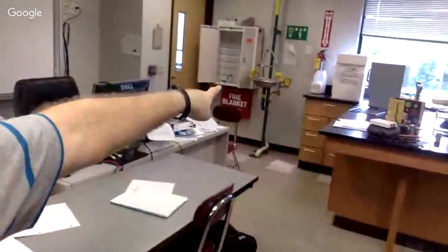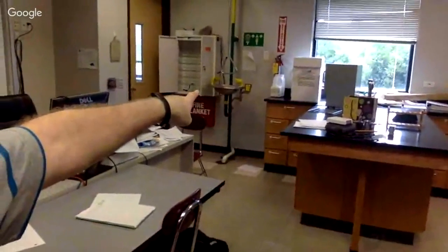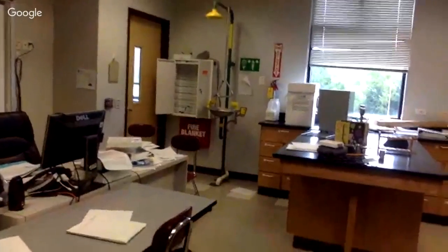I will say this: one of my groups, one of the steps is when you're adding hydrochloric acid to the test tube. They were doing the test tube and they're moving it, and it fell and it tipped over and spilled the hydrochloric acid all over the table. They grabbed it, so there's still a portion of it left in the test tube, and they did what they should have done. Immediately, they called me over. And I said, what's in there? And they told me specifically, there's hydrochloric acid in there. So I went over there, and if you can see right next to the eyewash station, there's a white container. That white container is a neutralizer for acids.